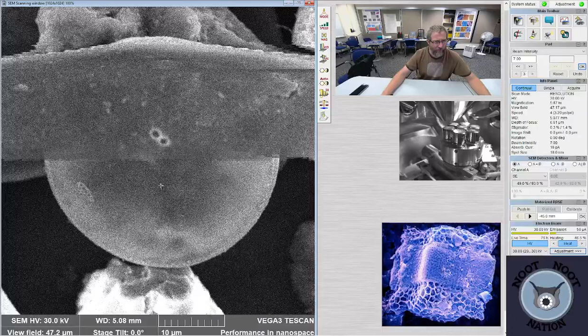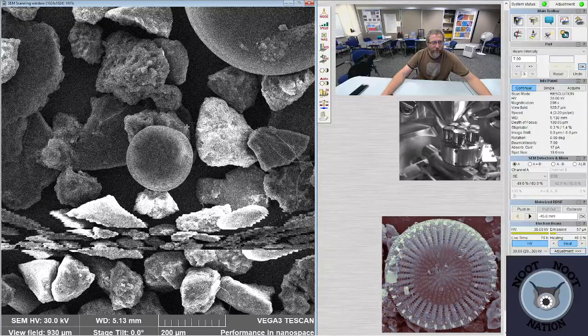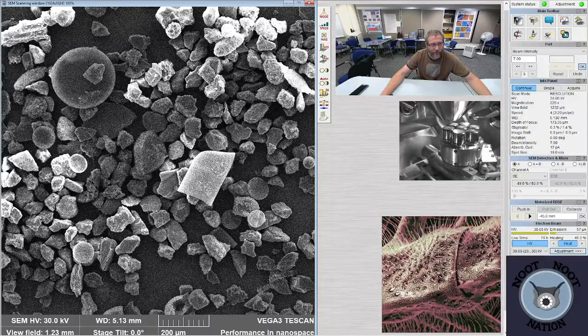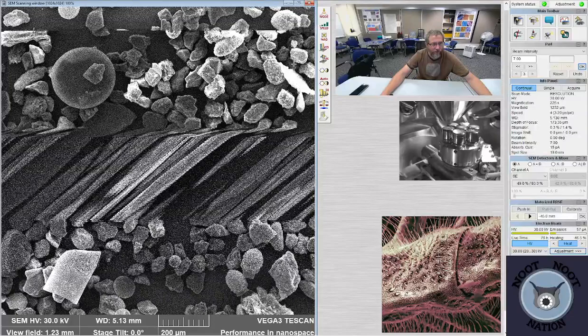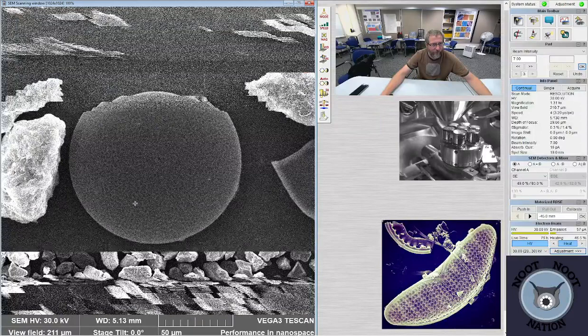Also don't know what this weird little guy is. I think it's a Coscinodiscus. If it's in the marine realm, and I don't know what it is, it usually ends up being the last Isthmia. But there's an Ismia. There's some Actinoptychus. Tintinnids. Still together, despite being processed. Coscinodiscus.